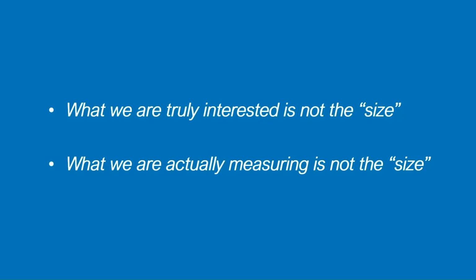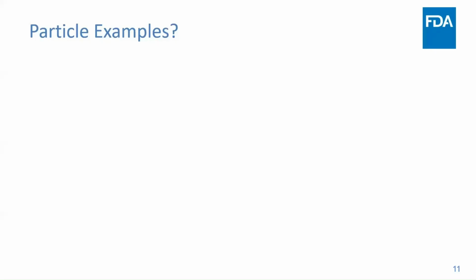I will start by explaining this morning the first part: what we are truly interested in is not the size. Later, through the next few courses on dynamic light scattering, laser diffraction, AF4, and subvisible particles, we will give you more information about what we are actually measuring. Is that the size or something else? So let's look at the first: what we are truly interested in is not the size.